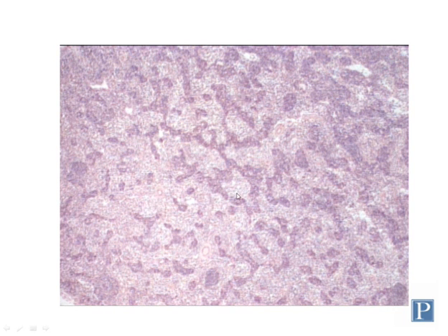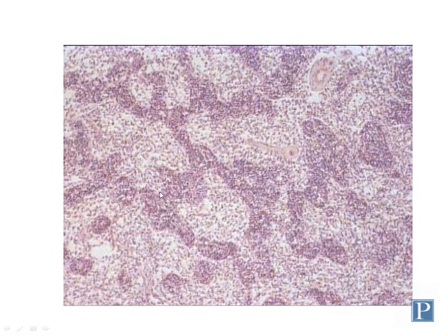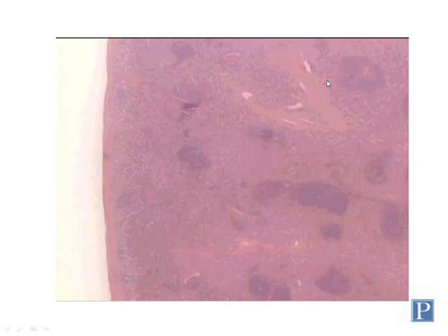In between the medullary cords, you have these fluid-filled spaces called medullary sinuses, which are filled with lymphatic fluid as it percolates through the lymph node. Here again is an even higher magnification view, and you can see cords of cells, medullary sinuses, as well as some blood vessels you can see here as well. So make sure that you can identify all the major parts of the lymph nodes.